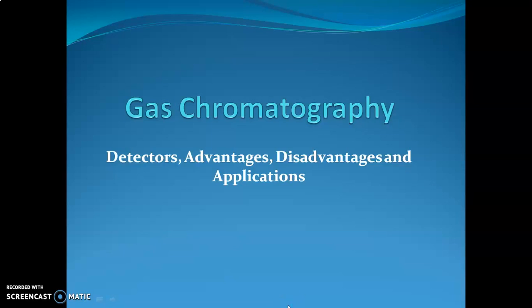In this video, I am going to explain detectors used in gas chromatography, advantages, disadvantages and applications of gas chromatography.